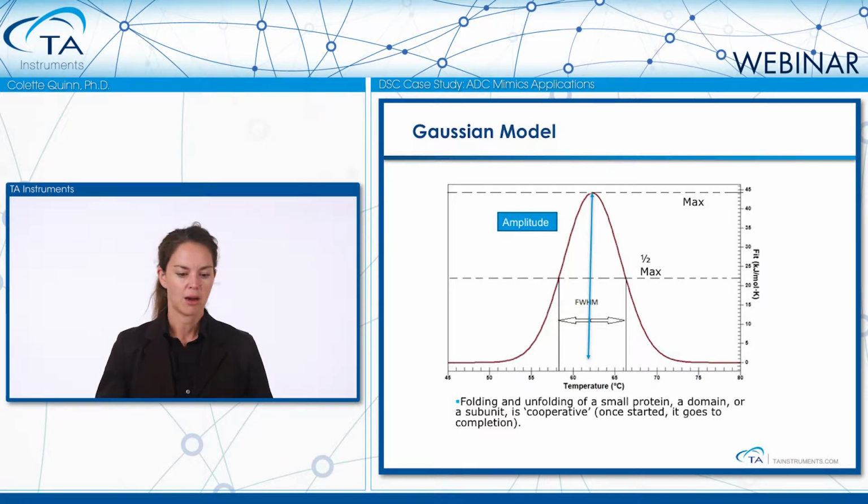So you've got some that could be a lower energy and some higher energy, but then the majority fitting in the middle, just like the Gaussian curve describes, right? Like a bell curve or a distribution curve. We'd really ideally want everything to be in a narrow curve, because then we at least know we've got majority in native or unfolded.